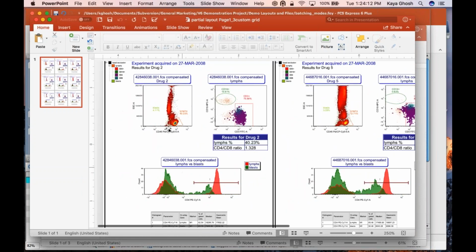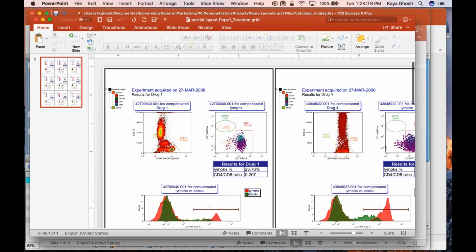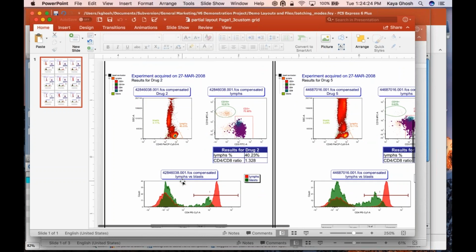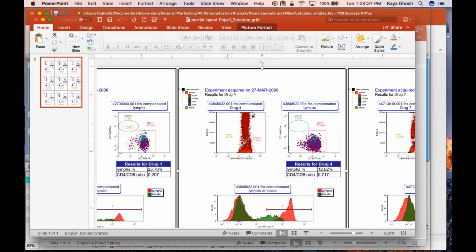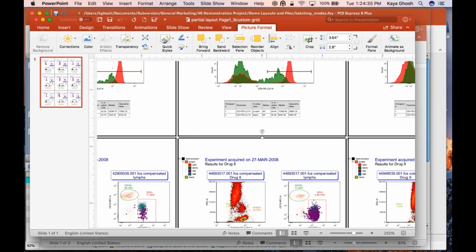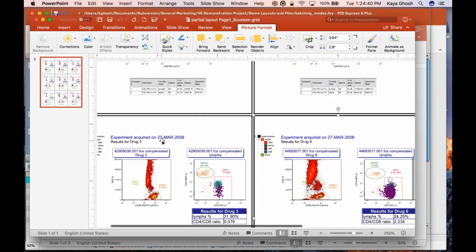Okay, so here at the top we have drug 1, which corresponds to file 1, and you see the black line going around, which is the frame around the page. If I go down to the next row, we have drug 2 and drug 3, and then come back to the top, and now it's started doing drug 4 right here. Drug 5, drug 6, and so on. Okay, are there any questions about how that works?